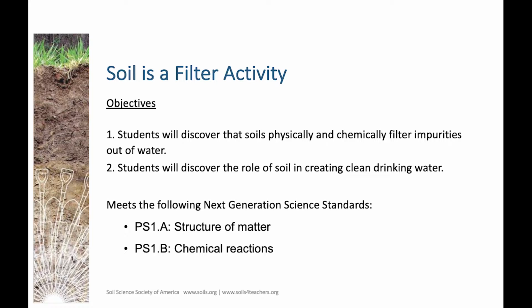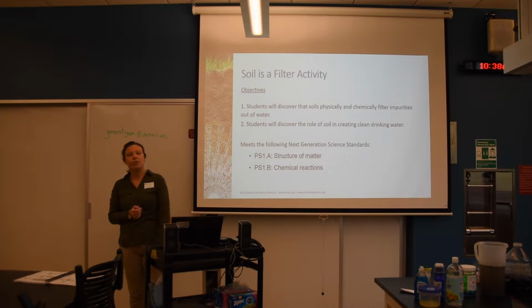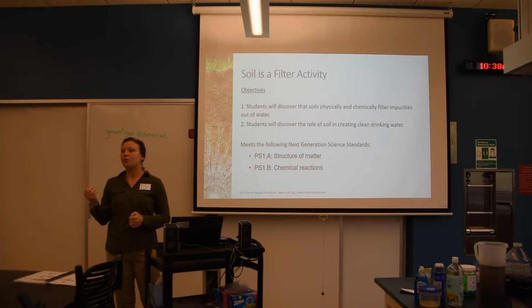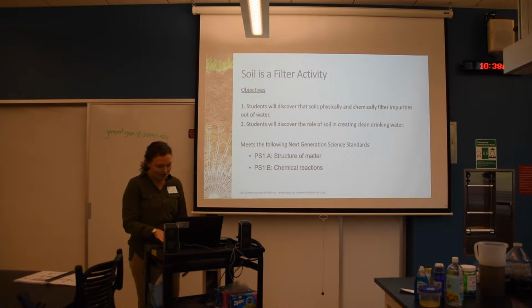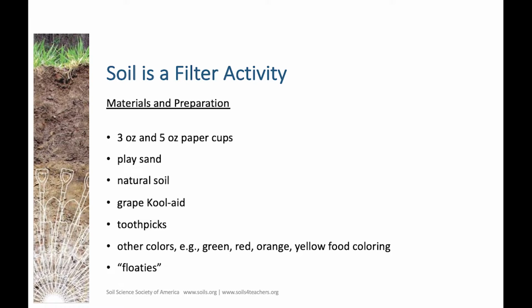And this will demonstrate how soils filter water both physically, so they remove physical impurities from contaminated or dirty water, and then we'll also demonstrate how soils filter certain chemicals out of water. So this addresses the structure of matter and chemical reactions Next Generation Science Standards. And then we have our list of materials.